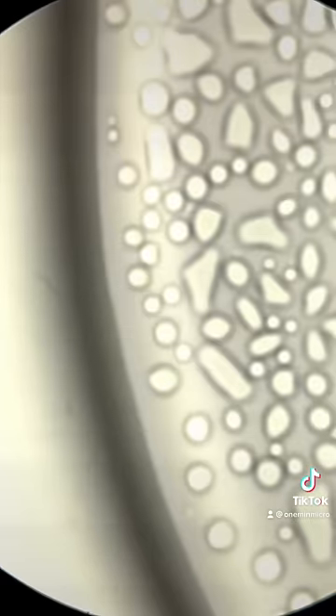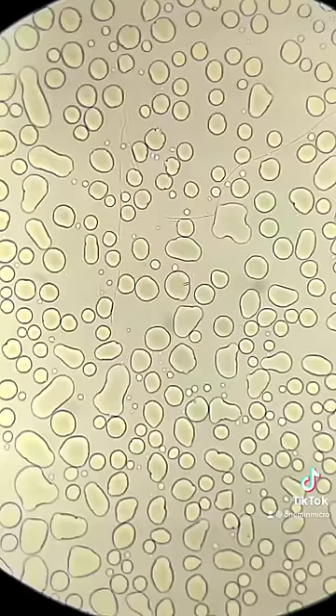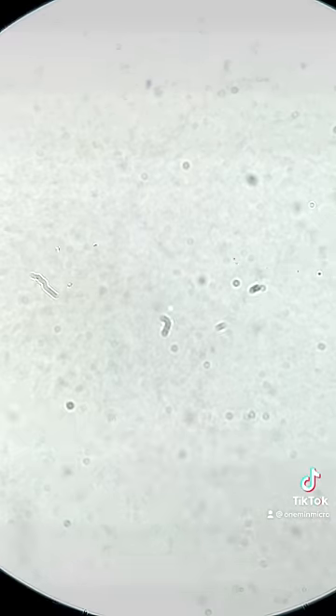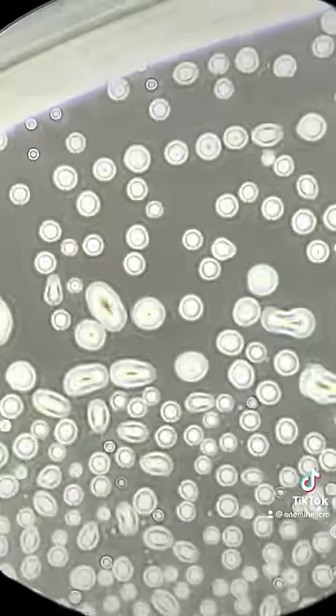This water sample is clean. There is nothing in this sample except for water. I even used my phase contrast lens, which picks up bacteria, but this water sample is clean.